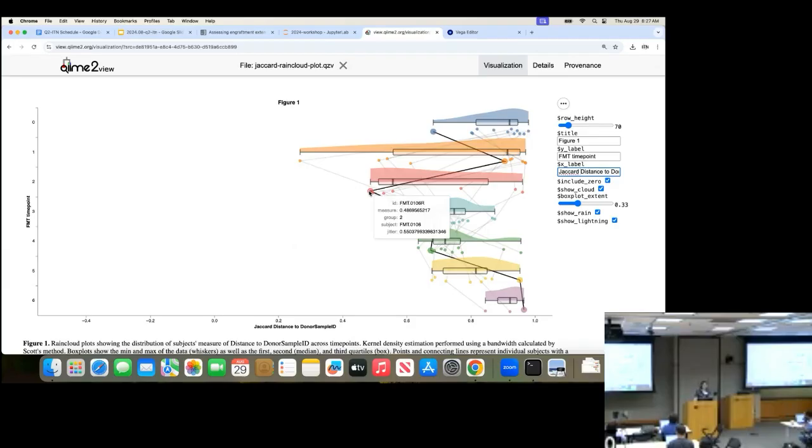I think it's very effective because it does allow you to see the population as a whole, and specifically go through and look at time points or subjects that you may know are problematic or not problematic. Maybe they're successful and that's why you want to look at them.